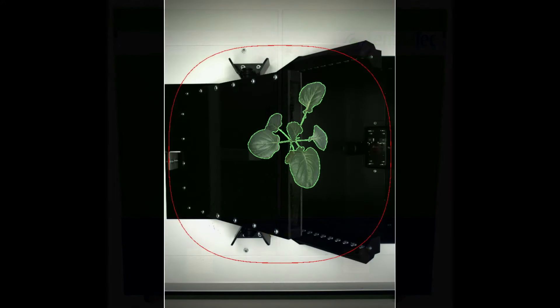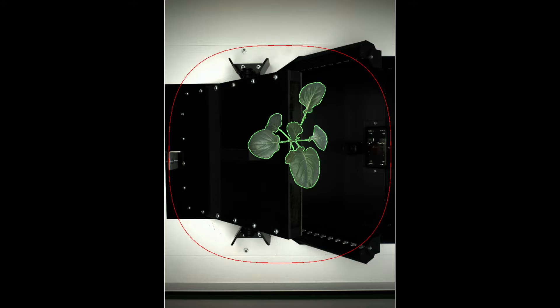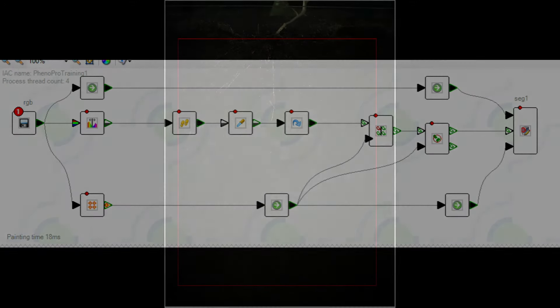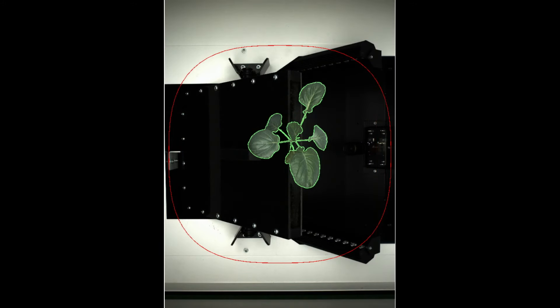The Lemnatec Phenotyping software package derives phenotypic traits from the images. For instance, length, width, and area can be measured. Geometrical factors such as compactness or eccentricity can be determined, and color information can be analyzed. Analysis parameters are available for both shoot and root.